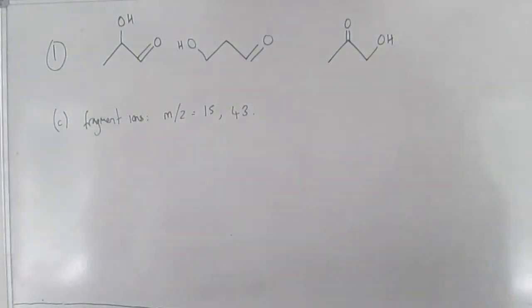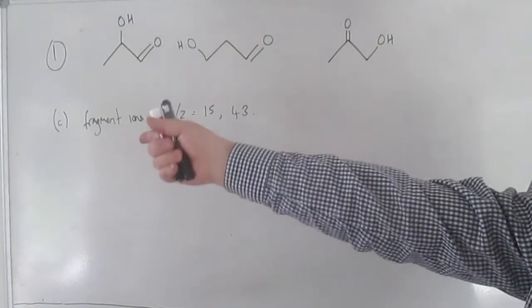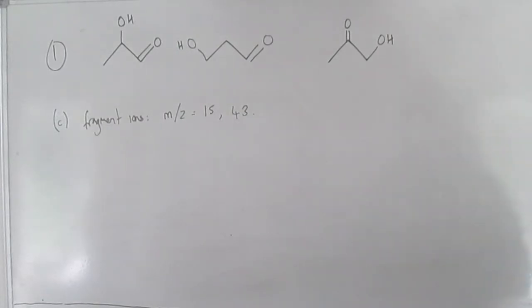And the crucial idea is that different fragmentation processes are possible, so not all the molecules will do the same thing. It's something that's difficult to get used to, because in chemistry you kind of grow up with the idea that when you add this to this, this happens. But with fragmentation of ions, it tends to be more unpredictable than that.